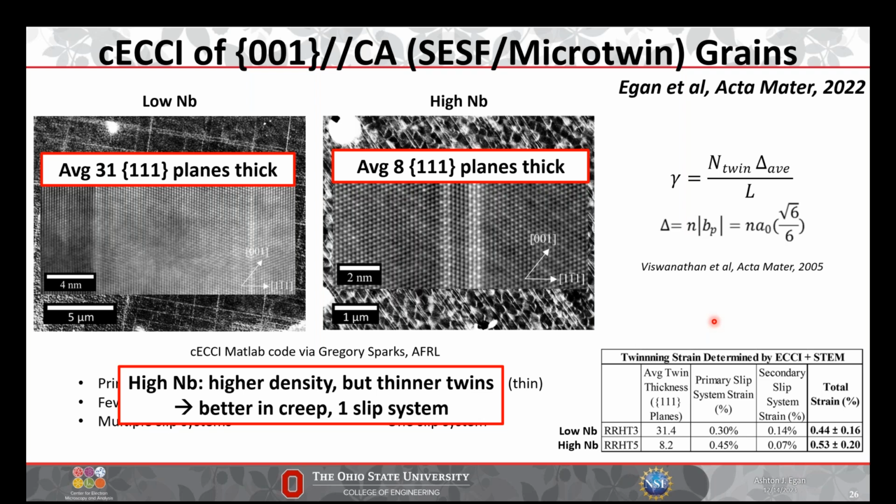And so in a nutshell, we've just used all of this EBSD kind of characterization to solve a metallurgical problem, right? Without it, we wouldn't have been able to do ECCI in a controlled fashion. So, this data was all collected from me driving around to various 001 grains, using Euler angles as an input to drive them to a diffraction condition, taking a bunch of images, sitting down for hours and measuring line densities, and then, on those same grains, using the Euler angles to determine, okay, this is how I have to lay the platinum to take FIB foils to look at these, essentially without tilting and at atomic resolution. So, it's a very simple, relatively straightforward technique in terms of getting the data that I acquired, right?